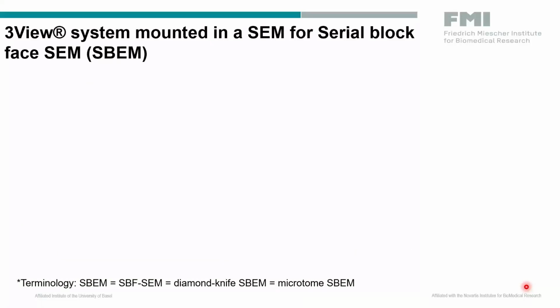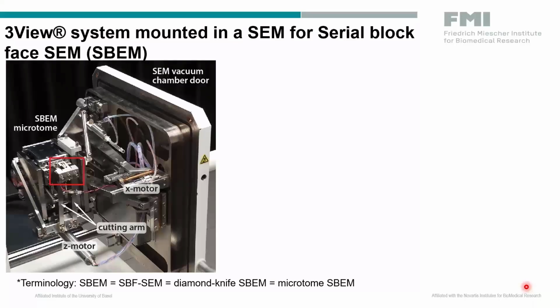Now, let me go quickly over how the microtome is mounted in a SEM.